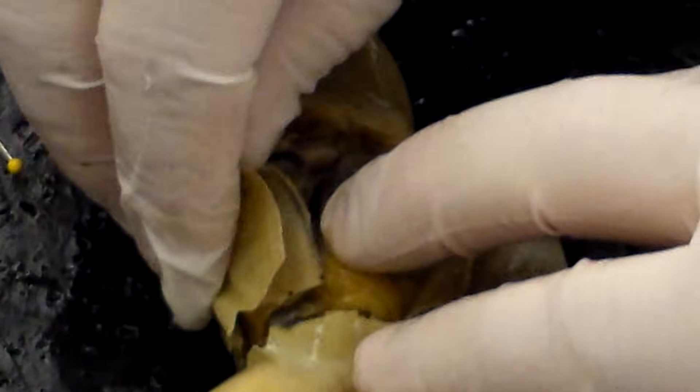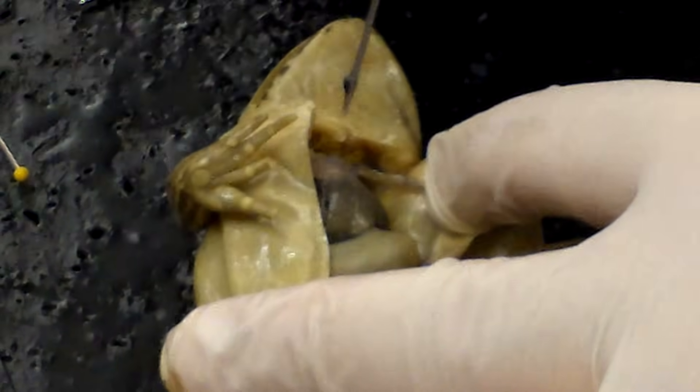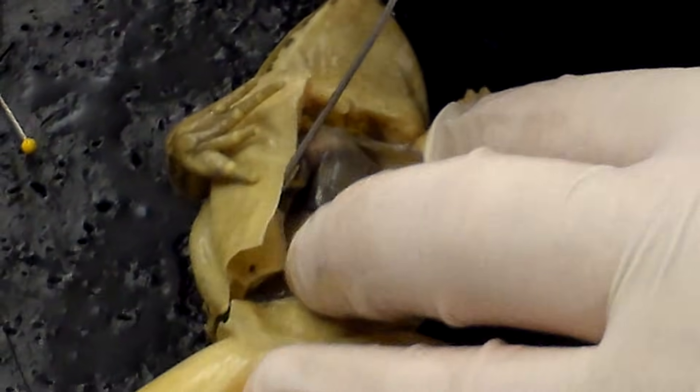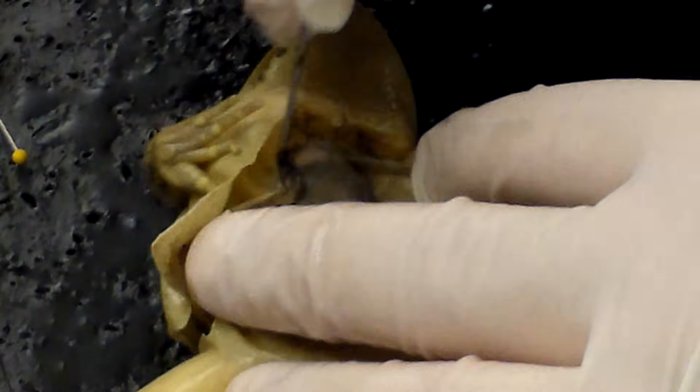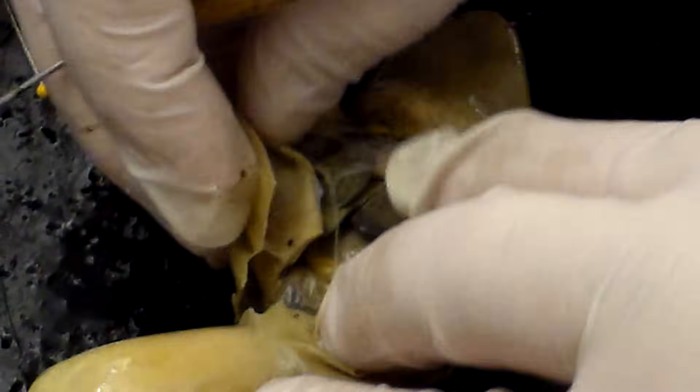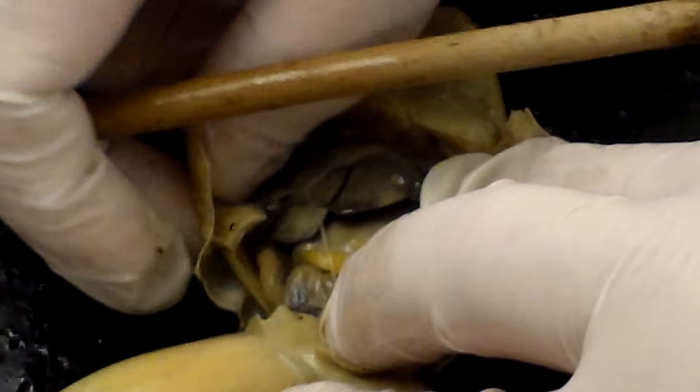When you open it up, we can see the internal organs. Some of the tissue might be stuck to the layer of muscle by some membrane — you might have to tease that membrane off. All of our internal organs are connected by internal membranes called mesentery. The mesentery holds everything in place so that things don't move around too much.